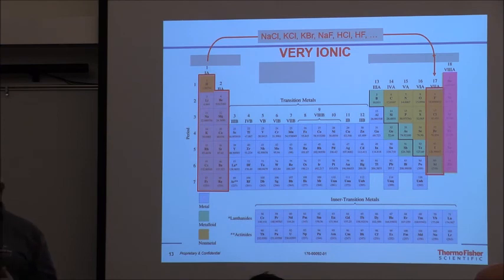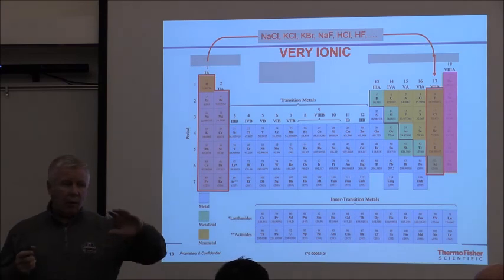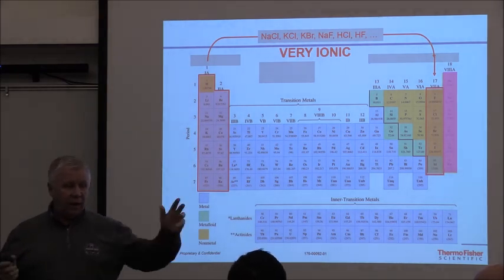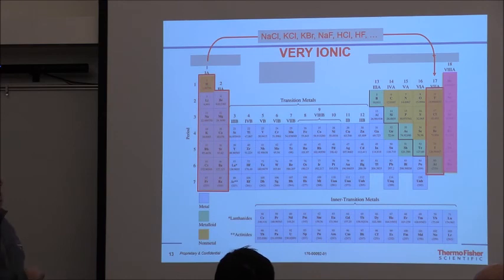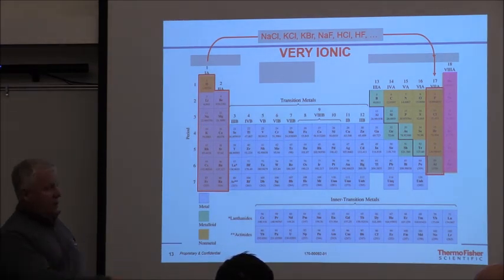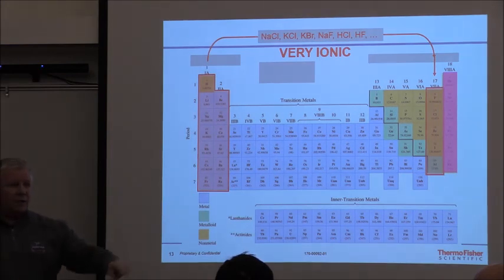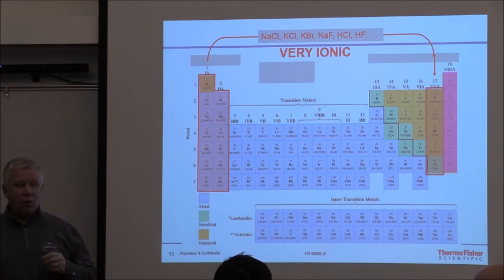Okay? We'll do a sample. Let's talk about acid for a moment. You're going to go out in a spill, and you measure it, and it has a pH of 1. It's an acid. Now, you can do different things, and I'm not here to tell you how to run all your other stuff. If you have an FID, run an FID. Hey, it's an organic acid, inorganic, you can do whatever. Okay? But hydrogen is in group 1, right? Where's chlorine? Right there. Is that a group 1 and a group 17? Yes. Will the devices see it? No. What's the only component of hydrochloric acid that the devices will see? Water.